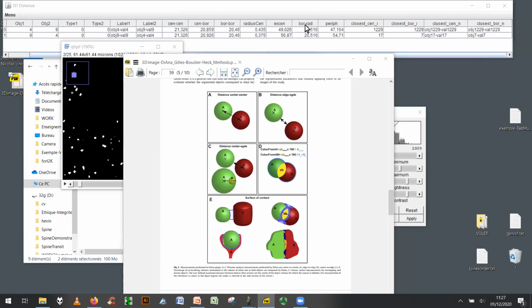So Florence is asking whether figure B is border to border, and whether this border to border corresponds to the closest border here. So you imagine you have this image with 5,000 objects. You will measure the border distance between this object and all the objects, and see what is the closest object, considering this border distance, object 4 or 9.